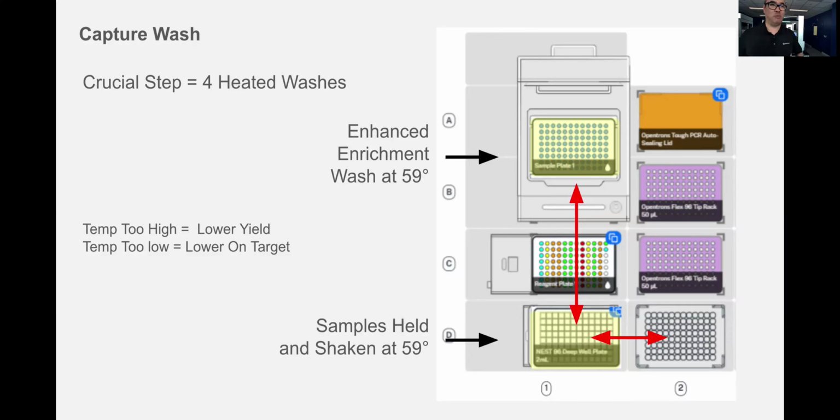I did this before with the OT-2 and without a gripper, manually switching the stuff there and back and forth again. Just all the features now added on the Flex greatly alleviate these things. It's not necessarily faster than I do it manually, but simply being hands-off is a huge value added.